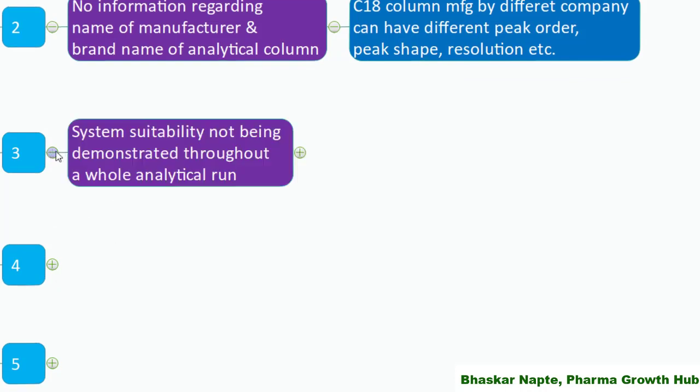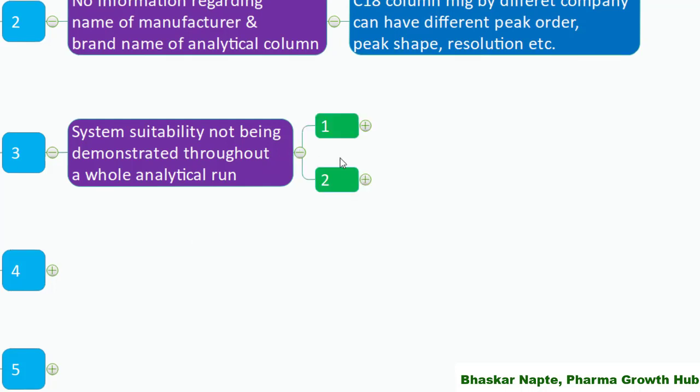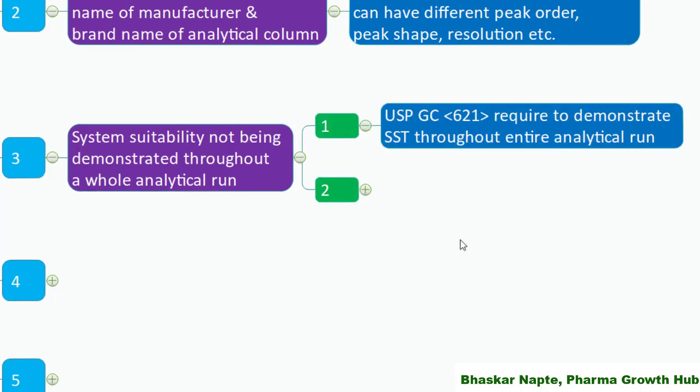The third important point is system suitability not being demonstrated throughout the whole analytical run. USP General Chapter 621 on chromatography states that you need to demonstrate system suitability not only at the beginning of the run but throughout your entire analytical run. This means you need to inject standard solutions after a suitable number of test sample solutions and confirm that the system is still meeting system suitability requirements.